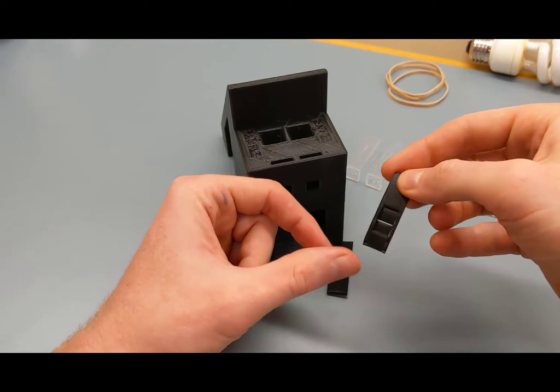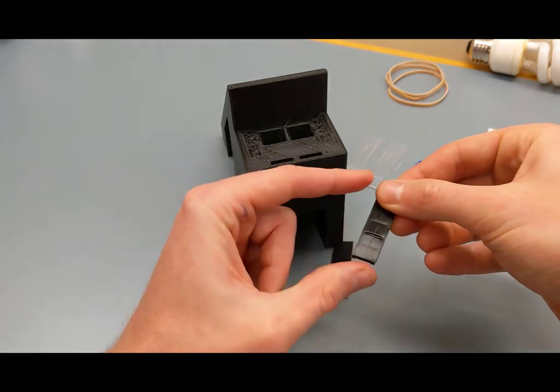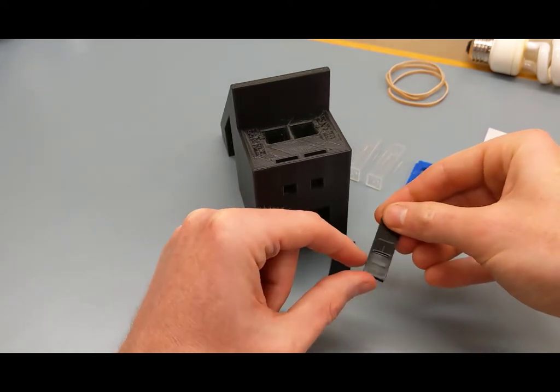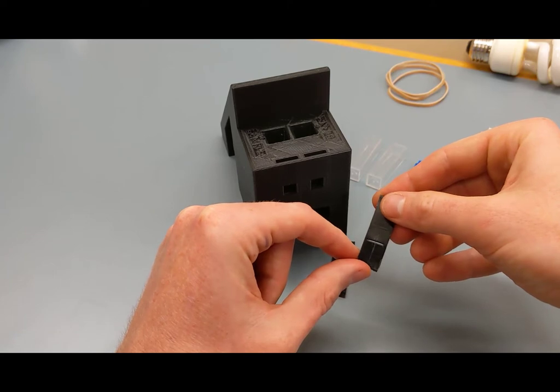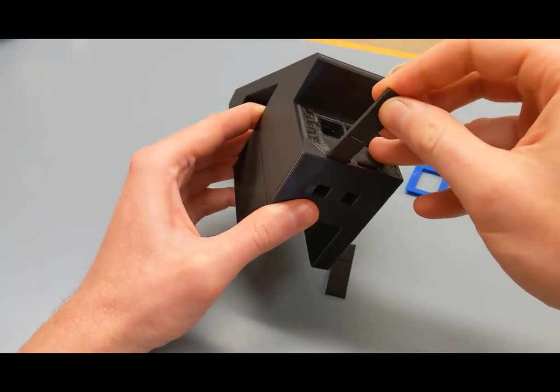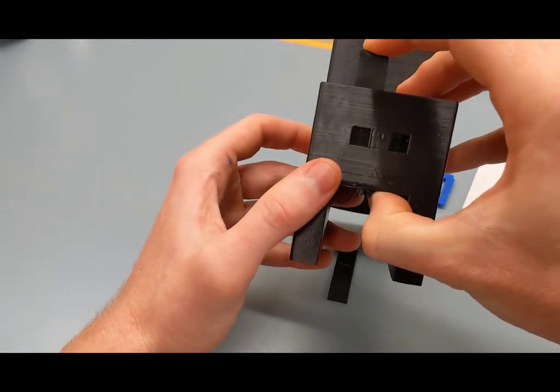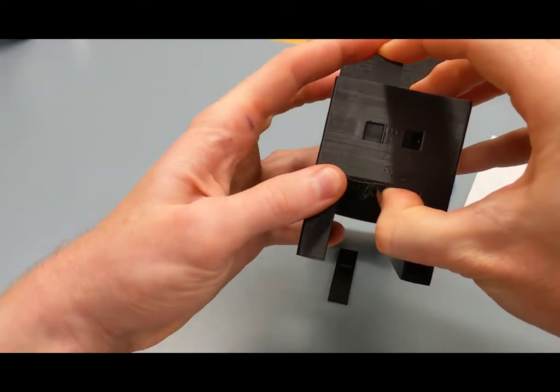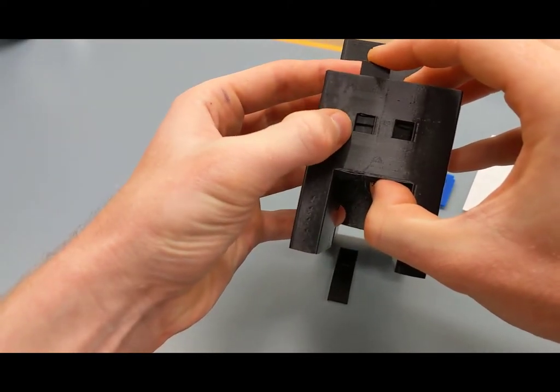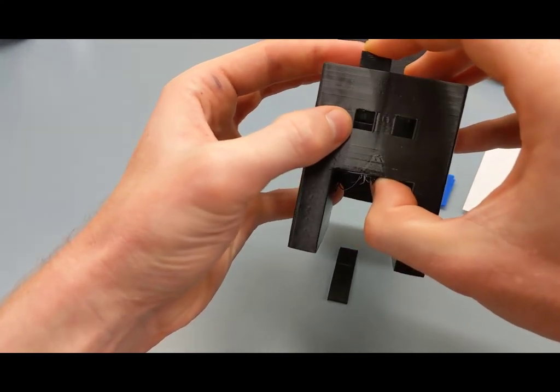One side has an indentation and the other side does not. It's not super critical which way you orient it, but you want both to be consistent — so if you choose one direction, do that for both slits. Insert the first slit into the slot; they'll be a little sticky so keep pushing down until the slit is clearly centered in the aperture.